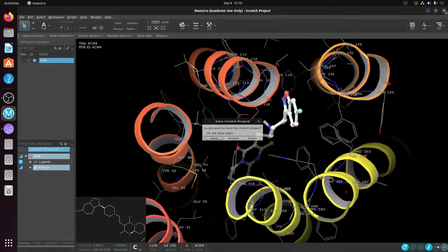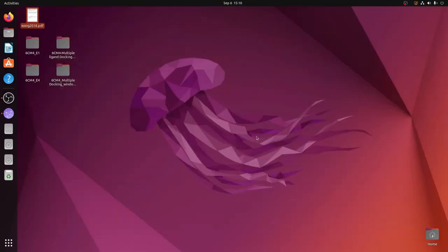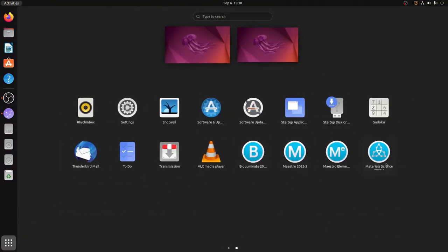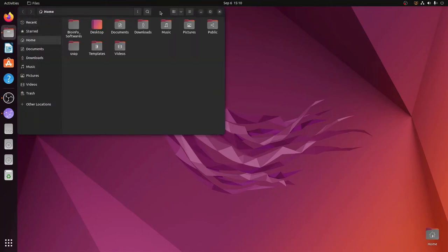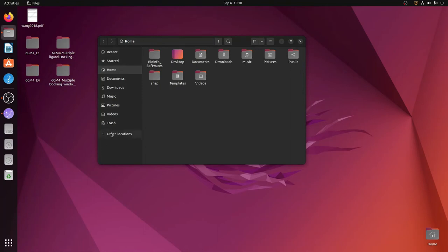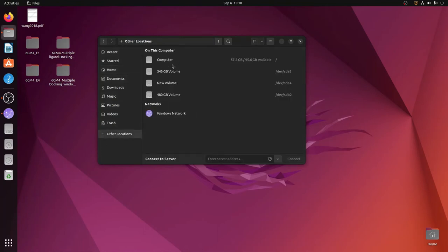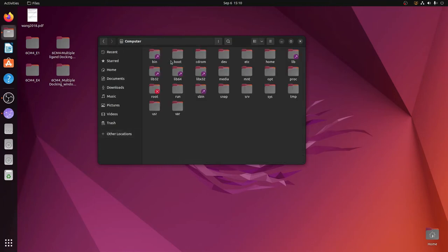Maestro is working correctly in the Ubuntu environment. Now we have correctly installed the free version of Schrodinger Maestro. The next thing we want to do is uninstall it. To uninstall, first remember where we installed the software. Open the home folder, go to 'Other Locations', and click on 'Computer', which is the root directory.